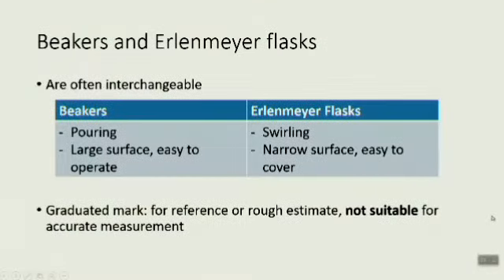Okay, good. Now we have a short summary about the beaker and Erlenmeyer flask. They are often interchangeable. However, in some cases we prefer to use a beaker, and in some cases we prefer to use an Erlenmeyer flask. For example, if we want to pour the chemical, a beaker is easier. But if we want to swirl the solution, the Erlenmeyer flask is more convenient.